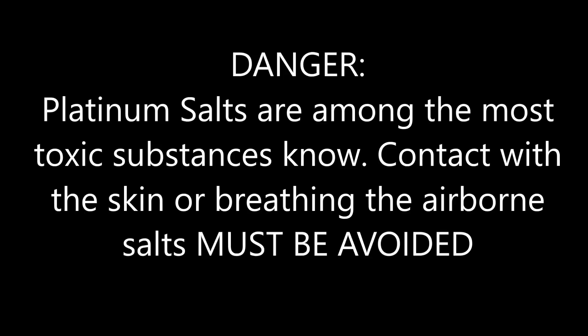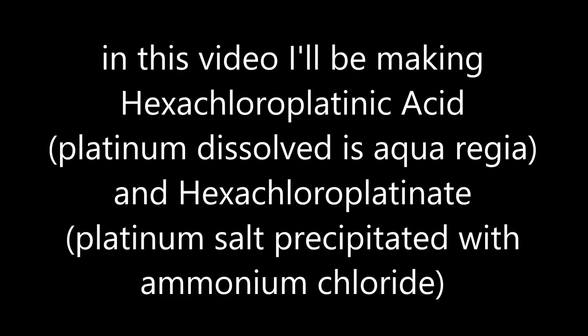Platinum salts are among the most toxic substances known. Contact with the skin or breathing the airborne salts must be avoided. In this video, I'll be making hexachloroplatinic acid, which is platinum dissolved in aqua regia, and hexachloroplatinate, which is a platinum salt precipitated with ammonium chloride.